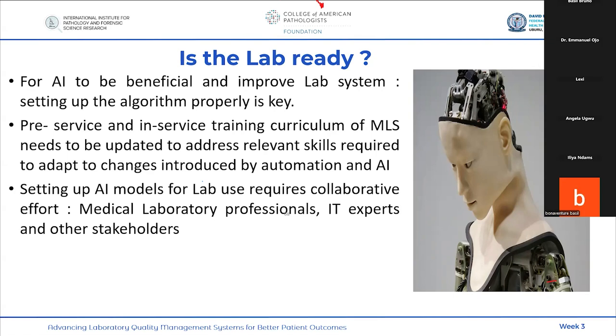And this also means, addressing the last point here, that when you are setting up AI models, it requires collaborative efforts of medical laboratory professionals, IT experts, and other stakeholders. I want to use this to challenge the laboratorians on board: the truth is that most of the laboratory information management systems being introduced nowadays have some elements of AI, so you see AI-powered LIMS.